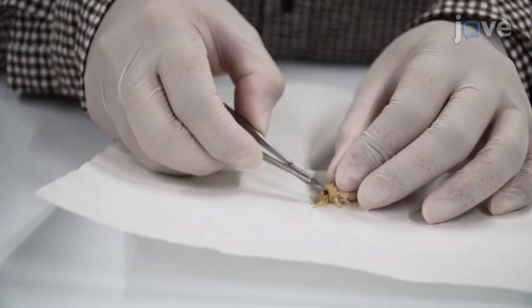Isolate silkmoth antennae using post-mortem scissors and cut both sides of the antennae.